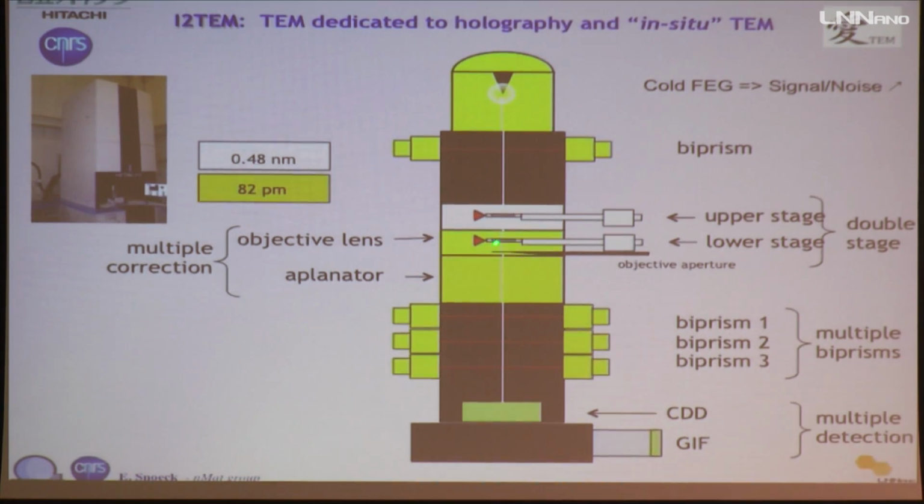And then in this position, when you switch on the objective lens, you have the huge magnetic field here. And the idea that Hitachi had is not to switch off the objective lens and put an additional lens, but to move the stages and put a stage above the objective lens, okay? And what we asked Hitachi is to have these two capabilities.